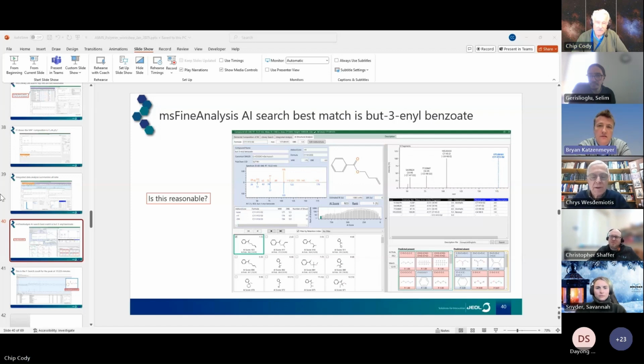You just need a mass list, so it's essentially a CSV file with masses and intensities, and then you can use the software. That's fantastic. It's not as full featured as something like Polymerix or anything like that, but it has a good, simple graphic user interface. Sure, that sounds great. So give it a try then. Thank you.